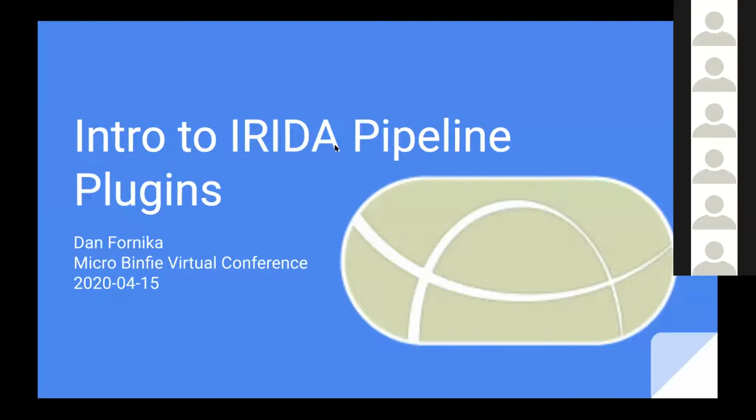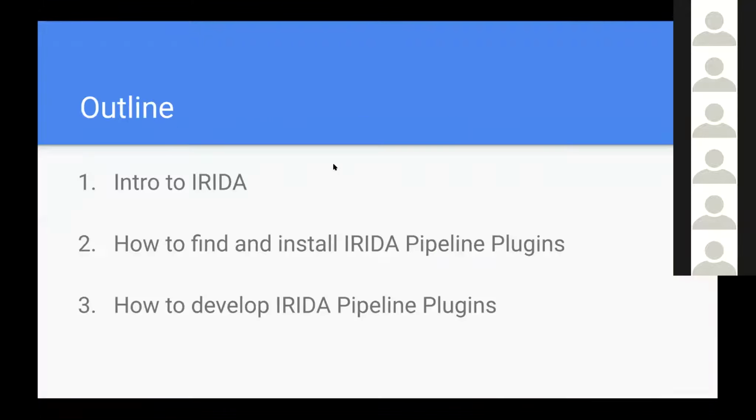All right, and as a nice segue, it's also included in the Irida platform, which is the subject of my talk today. So today I'm going to do a brief intro on Irida pipeline plugin development. So, okay, here we are.